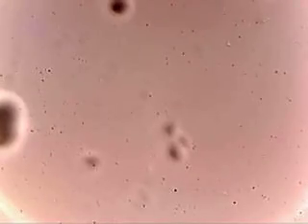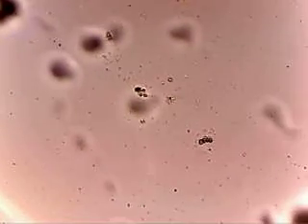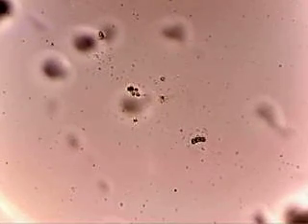What does all this prove? I really don't know, but I'm very suspicious of it being some kind of gas relationship. I would think that they like the smell of gas. No. Look at this here. Here again, it's the same thing. Very pronounced case here.